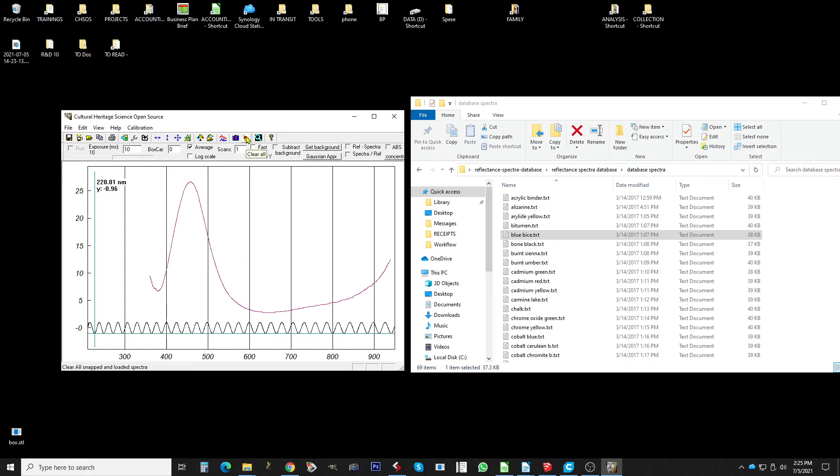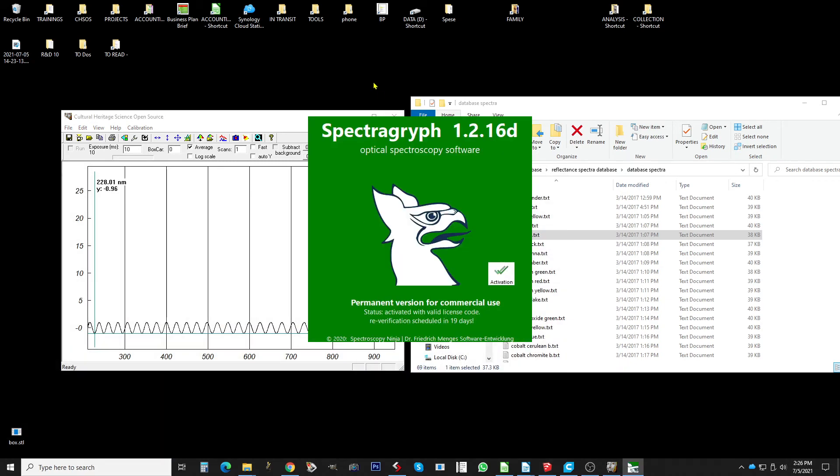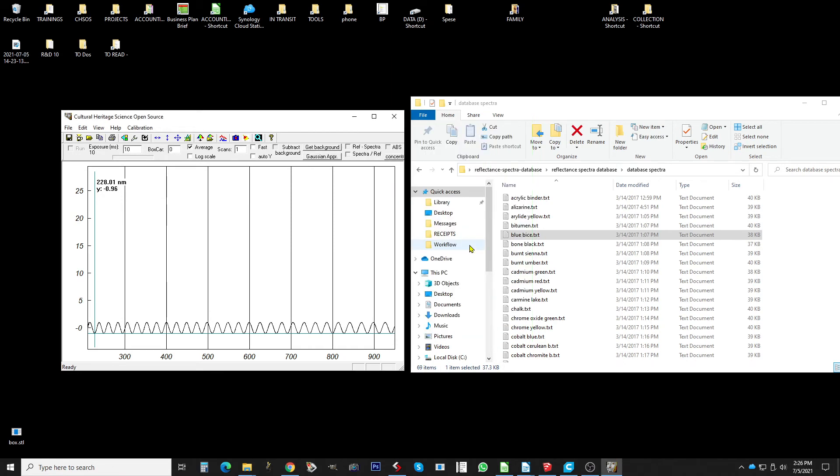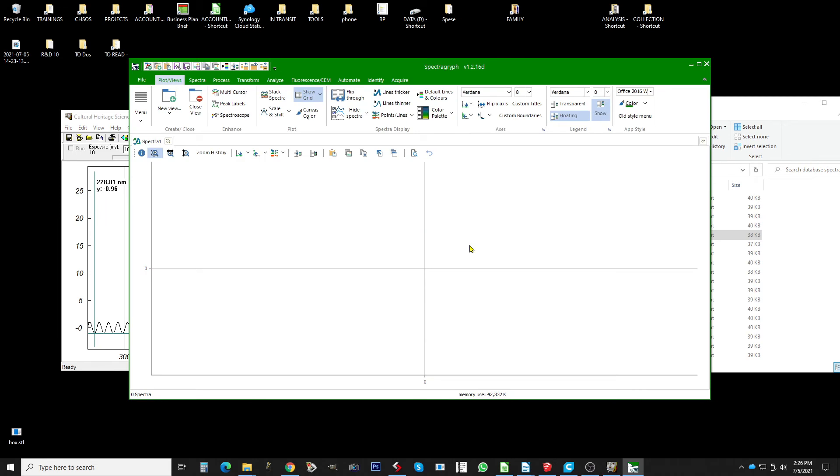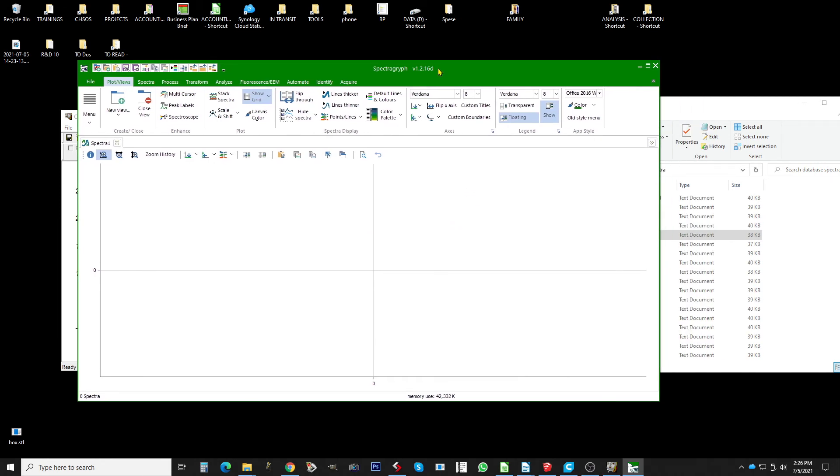What I recommend is to use another software, it's called the spectra grief, this one. This is a free software in particular for institutions, and the advantage of this software is that is much better in order to edit the spectra. So for publication, for comparison, it works pretty well with our spectrum.